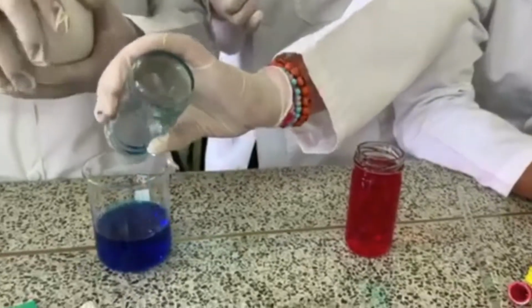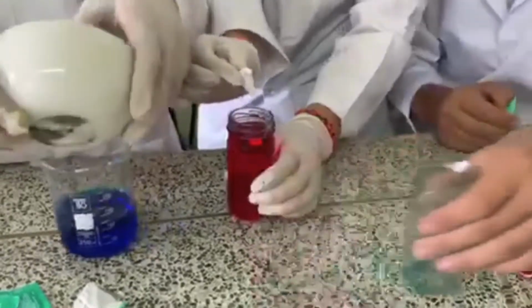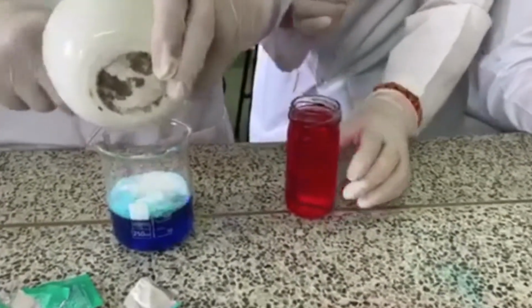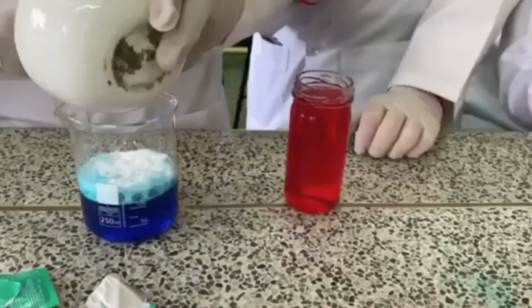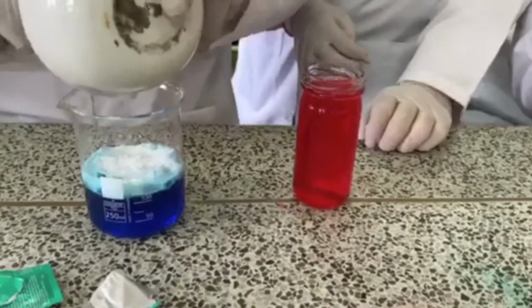Well, now I'm gonna explain experiment number 3. We're gonna take 2 beakers and add 200 milliliters of water to them. Then we're gonna add a little dye of color to differentiate them.